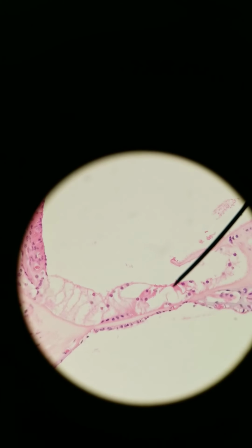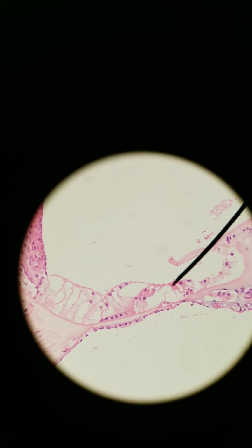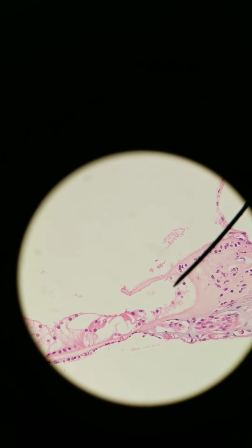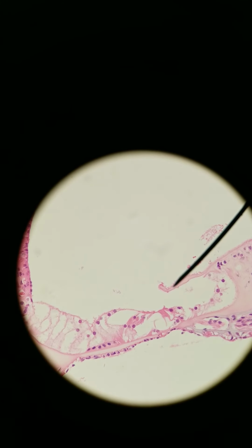So the hair cells, the stereocilia, they don't move themselves. Again, they're moved by pressure waves, but more than that, they're moved by something that's on top of the stereocilia. This membrane right here would be, in a normal physiological setting, on top of the stereocilia. This thing is called the tectorial membrane. If you've heard the term tectonics, like if there's an earthquake, there are tectonic plates that move. The tectorial membrane shifts around with these pressure waves.